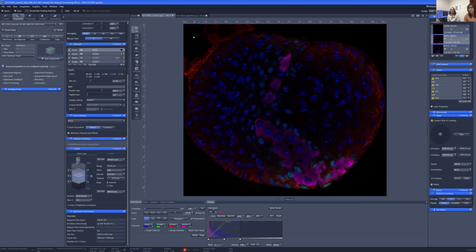And so, in order to do this, I have to be able to count the number of egg stem cells. And that's what I spent a lot of time talking about with you all yesterday: what methods I need to do to count them.